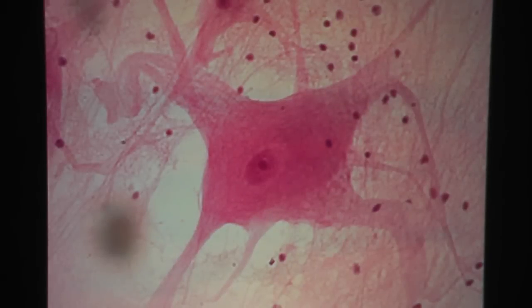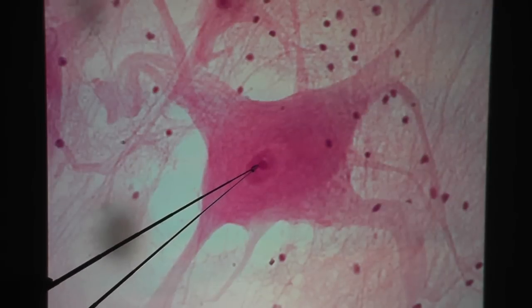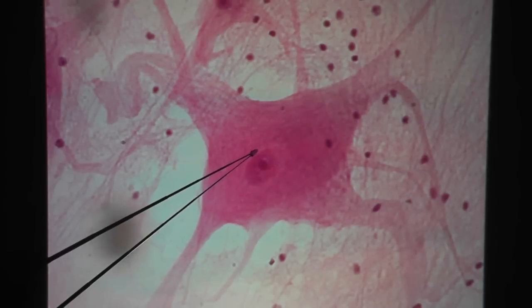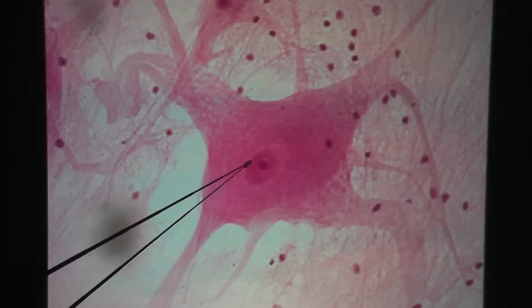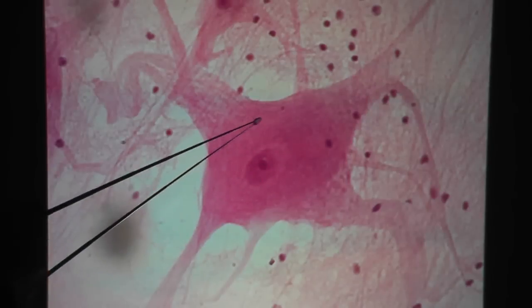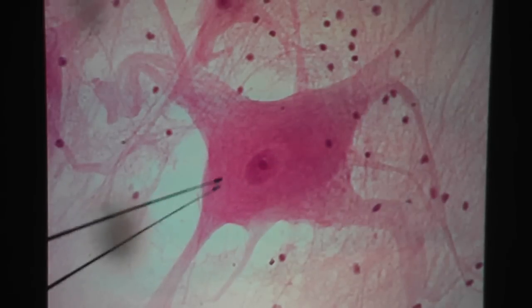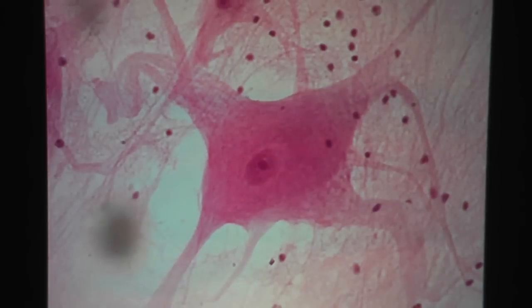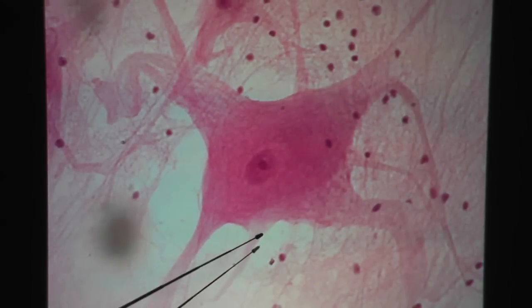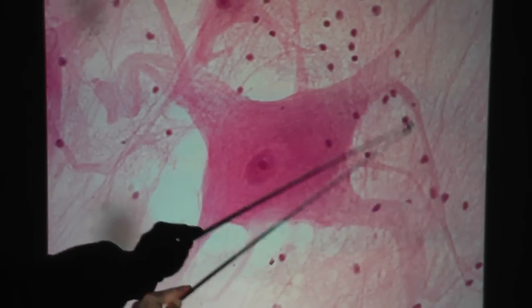This is a great picture of a neuron with a beautiful view of the nucleolus — that darker dot there would be the nucleolus inside the nucleus. Here you can see the nucleus pretty clearly — that ring around the dark dot would be the border of the nucleus. Everything outside would be the cytoplasm, and all of these would be processes. Because we don't see where they end, it's very hard to say which one is the axon and which are dendrites, so just call all of these processes. And of course we see lots of glial cells, because these would be their nuclei.